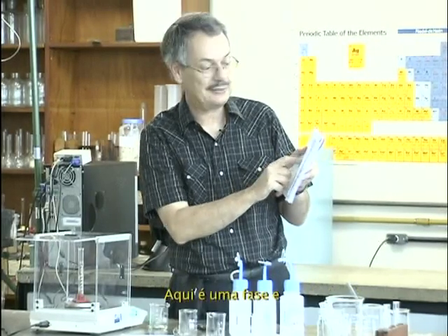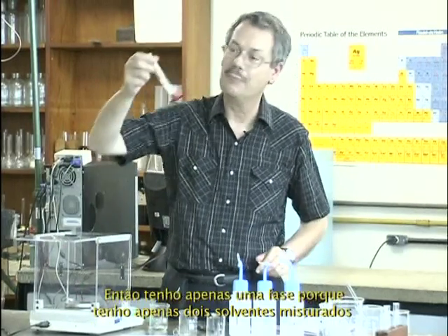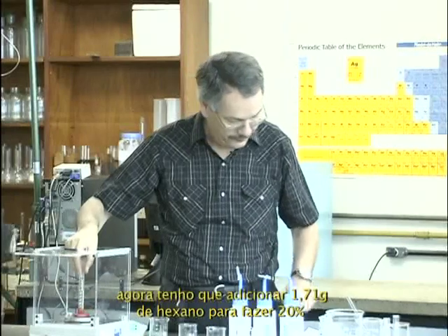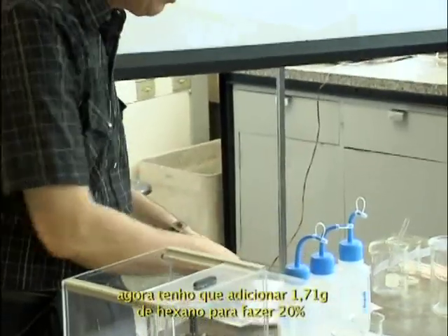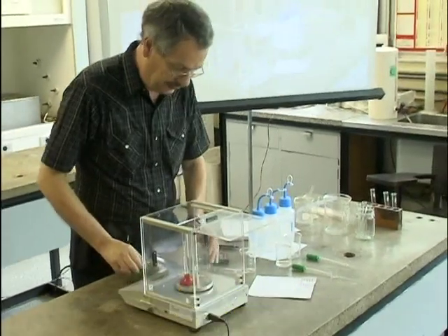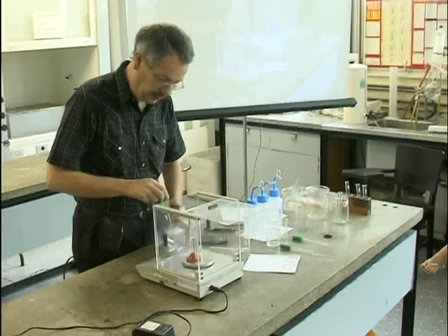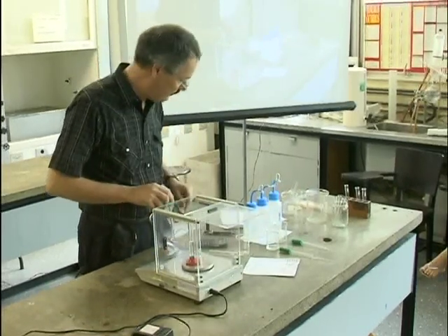This is one phase, this is two phases. So I have one phase now because I have just two solvents mixed. Now I have to add 1.71 gram of hexane to make 20%.